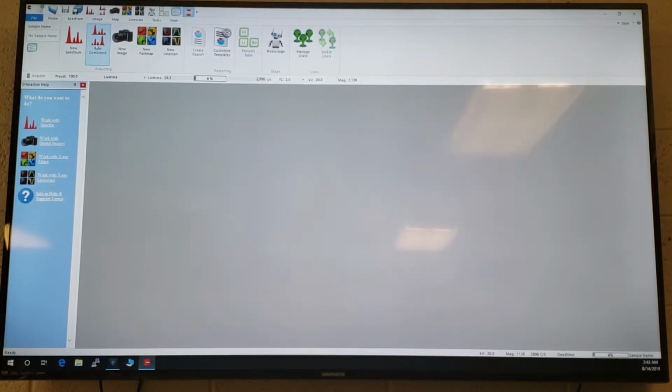Okay. Yeah, all right. So in that we throw you in there. Put a real source in there. That's right. How the hell do you protect it? Is that shielded? So it wouldn't fit in a cube, because the cube's too small. Oh, yes.